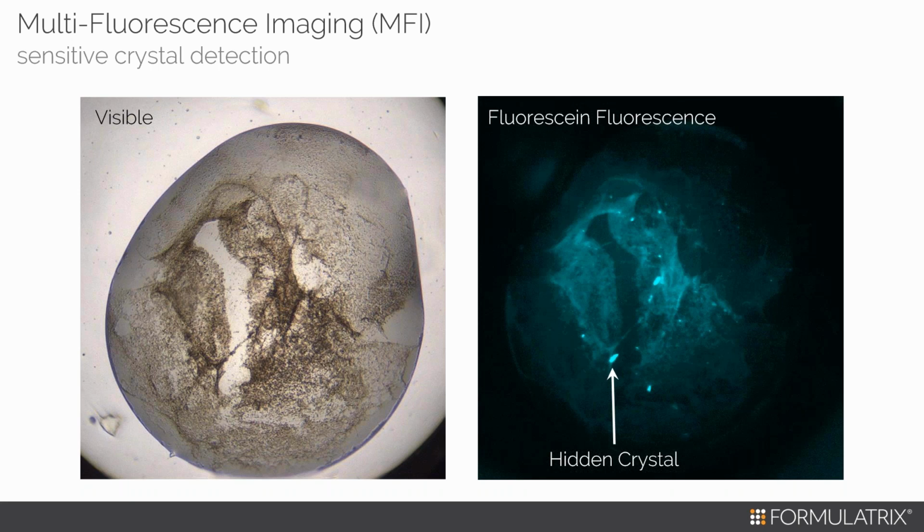So what you can do then is label your protein with a fluorescing dye, and there are multiple dyes available in the market: fluorescein, Texas Red, Alexa Fluor. So you can choose from a variety of commercially available dyes. So you label your protein with a dye, and that enhances the signal detection multifold.